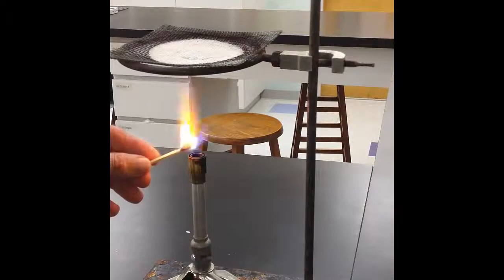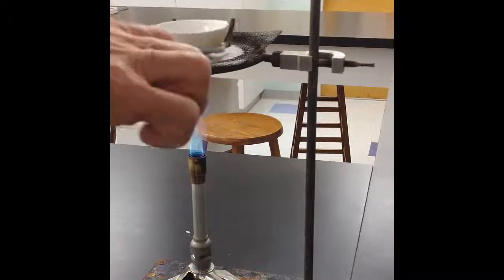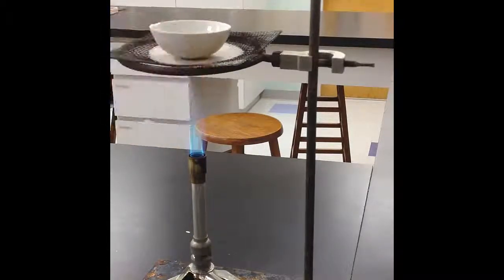Begin this lab by taking a small portion of 6 different samples provided by the instructor. Each of these will be divided into 4 parts in order to conduct the tests that we will use ultimately to identify the bond types.